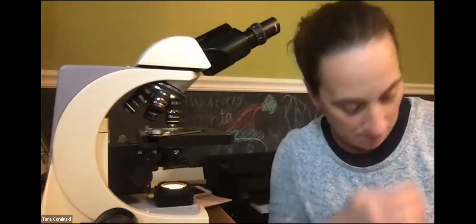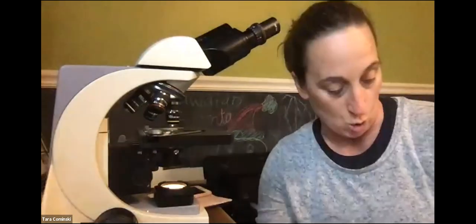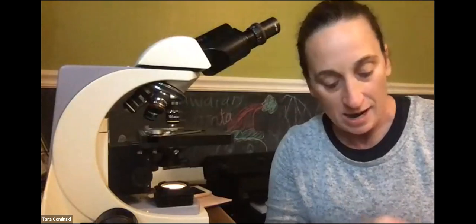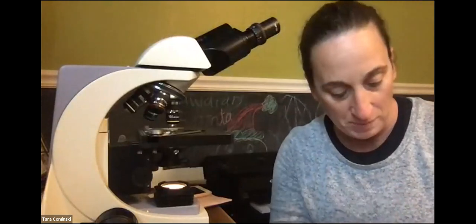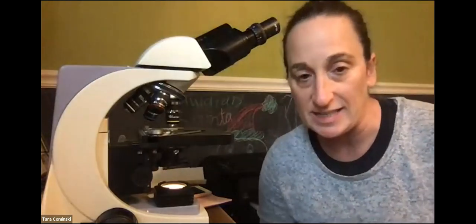Now, if we move on to page 17, this is now focusing on that stereo microscope, or the dissecting scope. You can take a look at that picture that's there. You are not responsible for this, essentially. You're not responsible for identifying the parts of the dissecting scope, okay? So you can kind of put an X through this, I guess, or just sort of skip over it, but you don't need to label that diagram, all right? But you can take a look at that. The reason why it's called a dissecting scope is you could put a specimen underneath there, right?